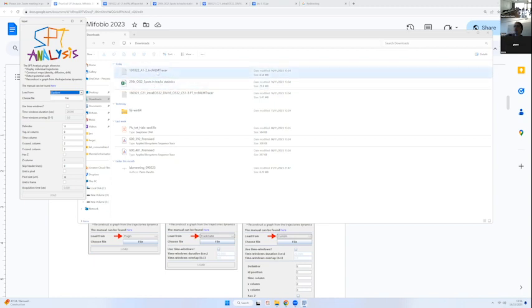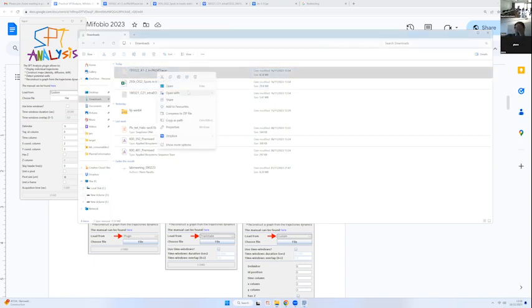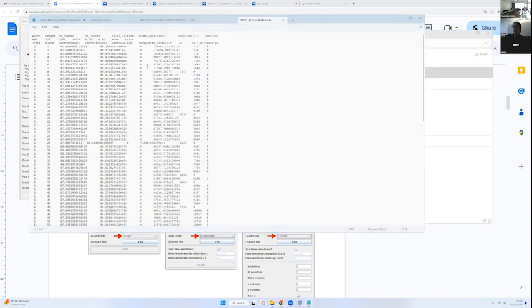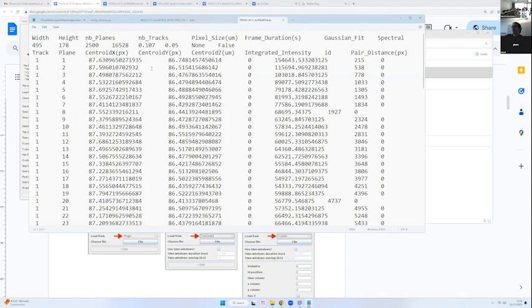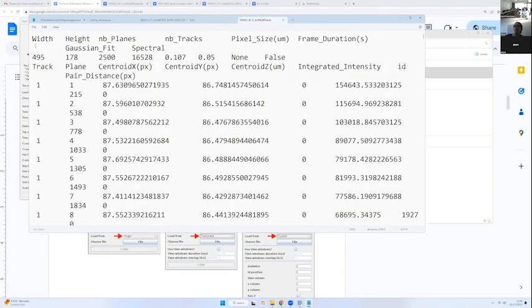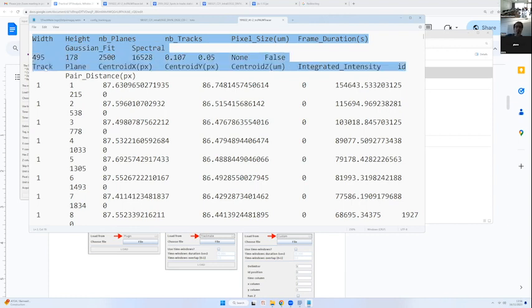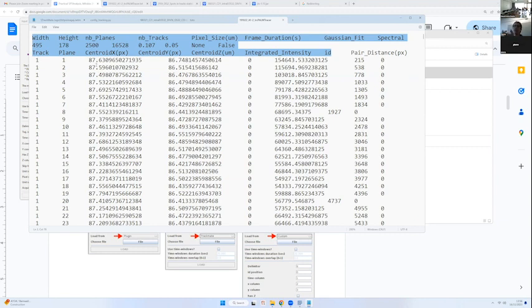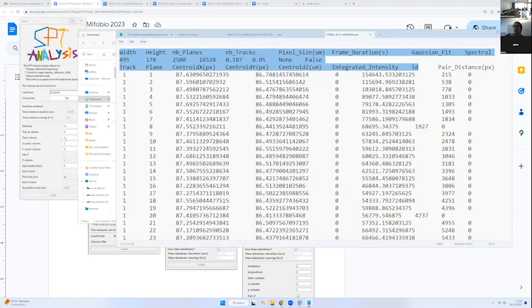So if we look at the first data set, which is the voltage gated calcium channels, and we just open the file with a text editor, we see that the first 3 lines of the file are actually not data, but just information. They are headers. So we are going to skip them. So in the input, we would say skip header lines, skip the first 3 lines.